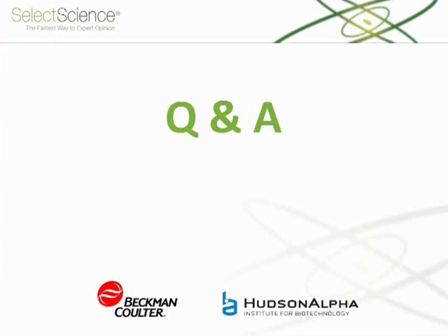And then if it's a standard input, kind of standard library preparation solution, just small numbers of samples, then the SPRIWorks may be a good fit. But I think they're similar in terms of sample throughput, but beyond that, I'd consider them very, very different instruments with very different target experimental designs.